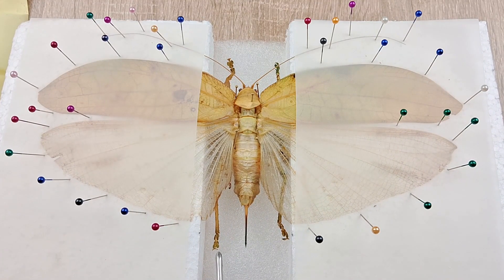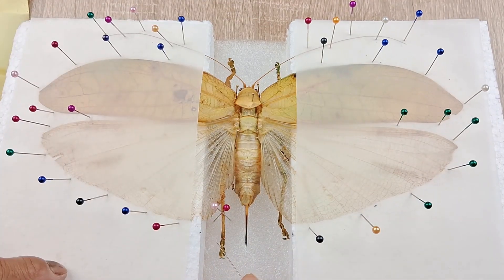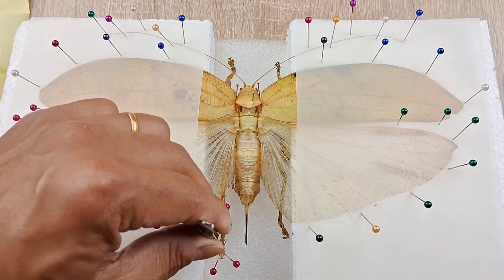Next, start working your way with the appendages. Using a pair of tweezers, extend the limbs and fix them in the desired position using several fixing pins as shown here. Do this with all three pairs of limbs.